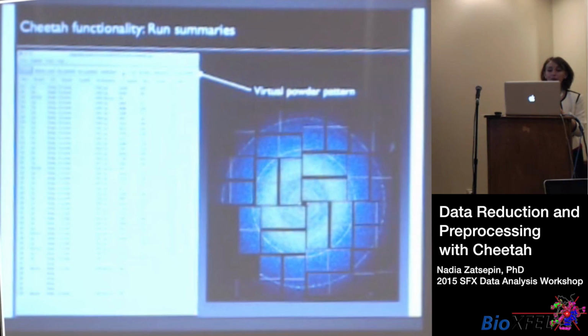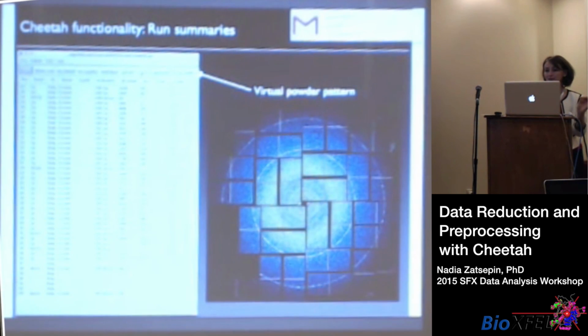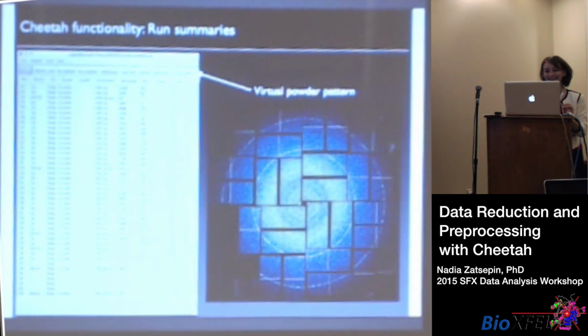This column is the number of frames it has processed, the number of detector readouts. So if you hear us talking about frames, it does not necessarily mean it's a diffraction pattern or it was actually a hit. So frames can be empty, frames can be whatever you want. So the number of frames processed, detector readout events processed out of that 120 per second, the number of hits Cheetah has found based on your hit finding conditions. It makes an estimate of the resolution, old snapshot, ignore this. It will make an estimate of the resolution, and it'll also keep track of the hit rate.